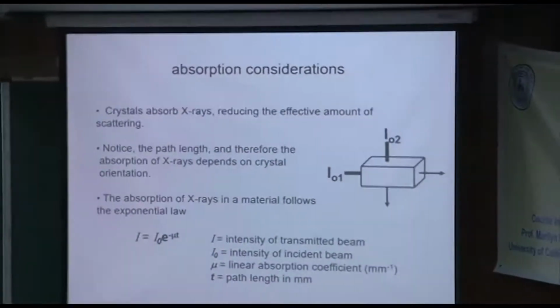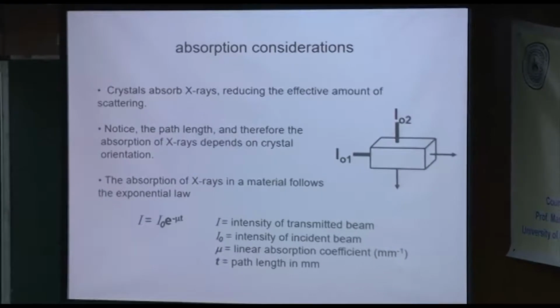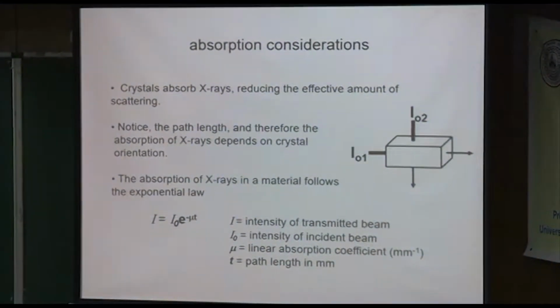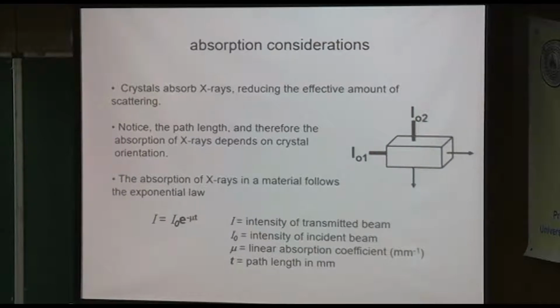And so one thing, we have a really nice periodic table in our lab which has absorption coefficients for all of the elements, and you can glance at it right away and see for both copper and molybdenum which would be more appropriate. And like I said, it's not always intuitive. But usually the amount of absorption is expressed as a percent, either transmission or absorption. They're inversely related.